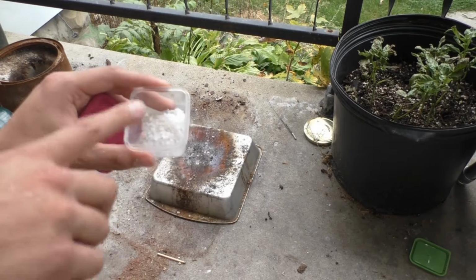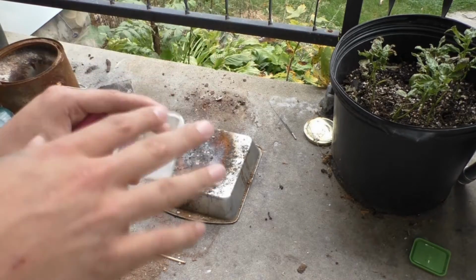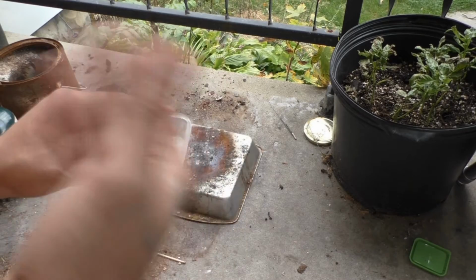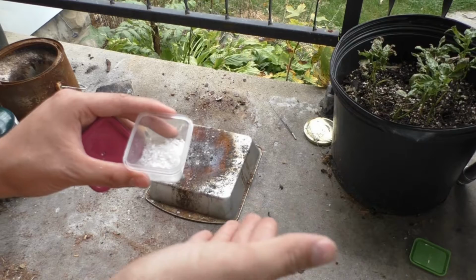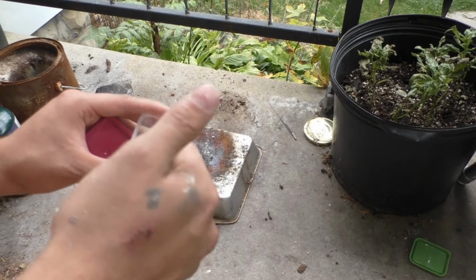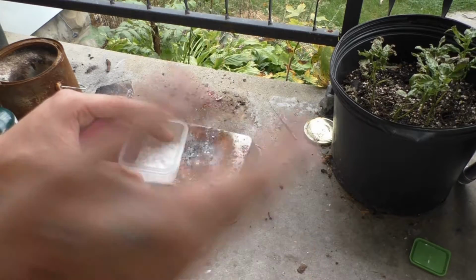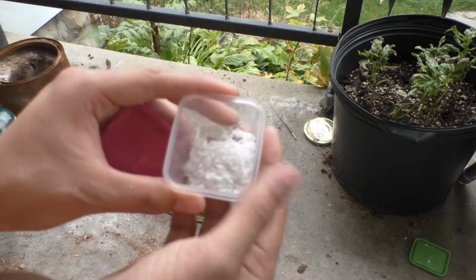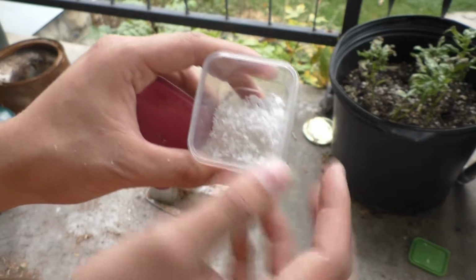So eventually what I ended up having to do is take the thermoplastic, melt it, make a very thin sheet out of it, and then keep blending up the sheet in the blender. But the problem is that if you just blend it continuously, the sheet would heat up and start sticking together. So I had to blend it for about 30 seconds, put it in the freezer, blend it for 30 seconds, put it in the freezer, and repeat the process over and over again. And this is the best I was still able to do.